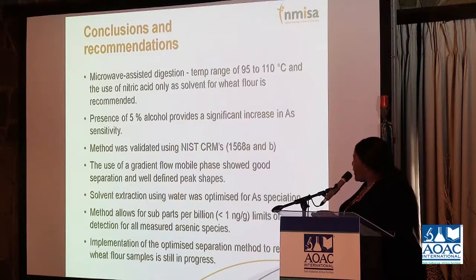Okay, I'd like to conclude by saying that we had a successful microwave digestion with a temperature range between 95 to 110 degrees Celsius, just using nitric acid as a solvent for wheat flour. The presence of 5% alcohol provides a significant increase in the sensitivity, as you've seen in the graphs. The method was validated using the NIST CRM 1568 A and B, and the use of a gradient flow mobile phase showed good separation and well-defined peak shapes.